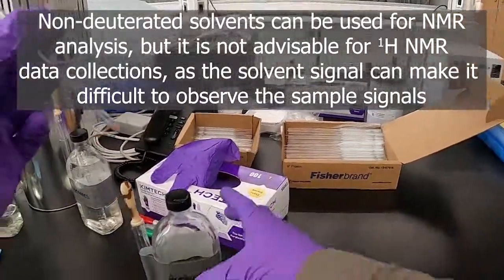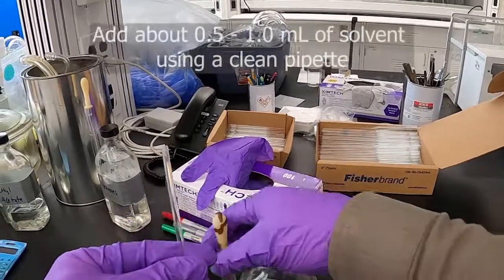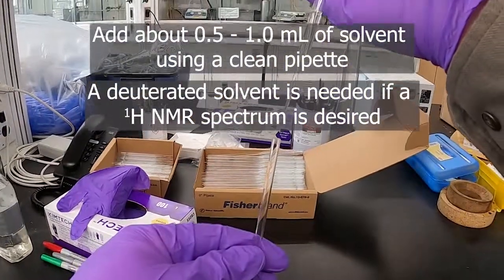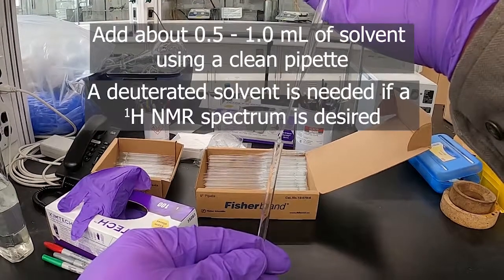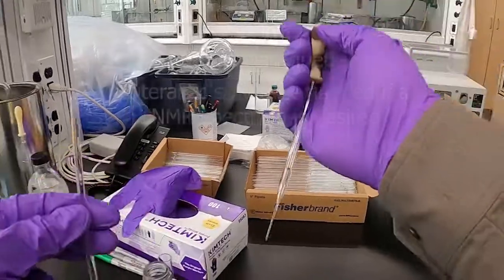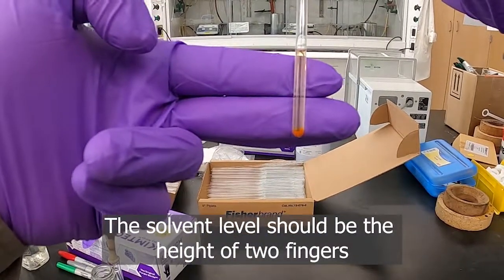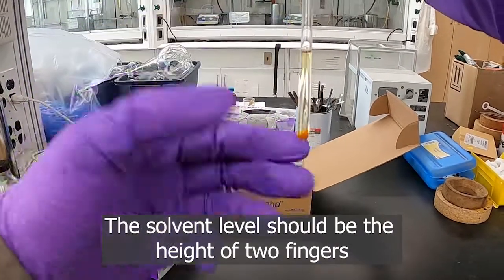When we go to add solvent to this, I'm just going to use regular acetonitrile for demonstration purposes. We want about an inch worth, or about two finger thicknesses. So I'll add some in here until I get about the right amount — about that much. You can see that's about two fingers, or about an inch and a quarter.